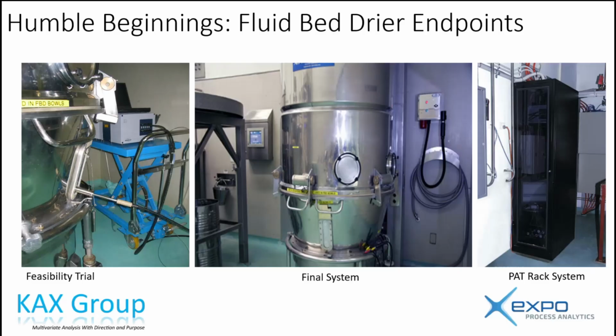And one of the things that I should note here is that here's your fiber optic probe. These are the design considerations. If that was to fall out of that box, it would never hit the ground. If the operators got bored during the night and they decided to use this probe, this little alarm here would go off and scare the absolute crap out of them. Okay. And then somebody would have to come in. And then here, this was our network computer box just behind it. Okay. With RAID 5, multiple storage systems.